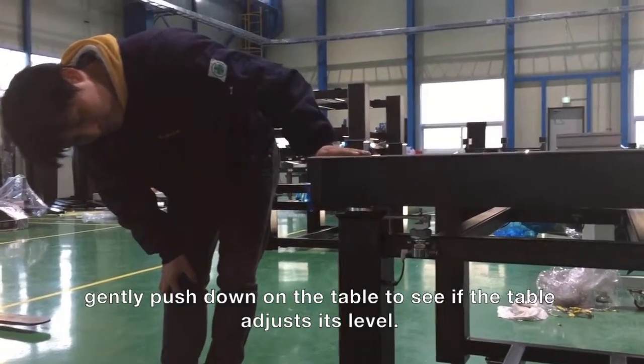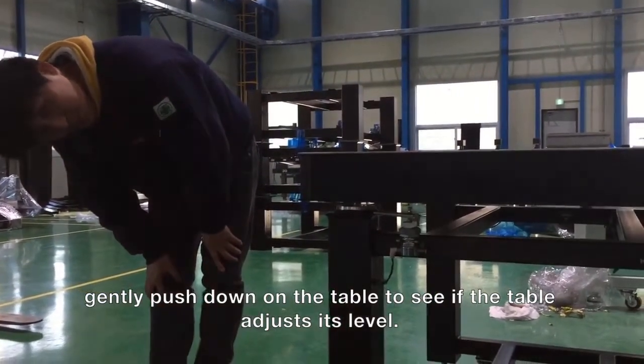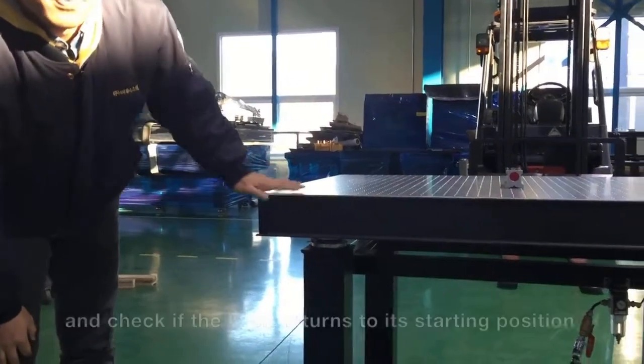Step 6. Final check whether the optical table has been properly adjusted. Gently push the table down to see if the table adjusts its level. Check if the table returns to its original position.